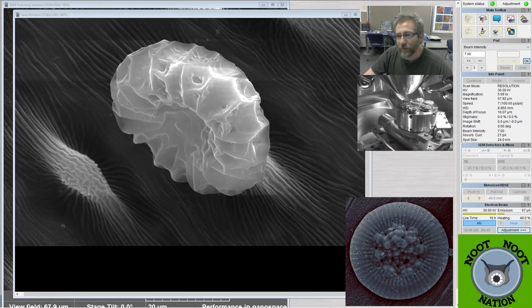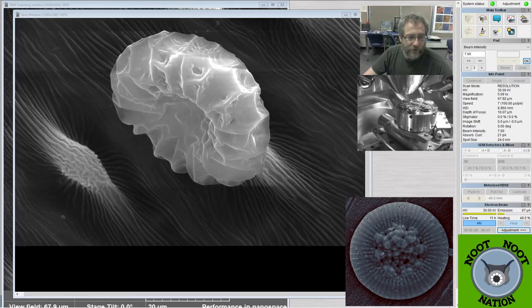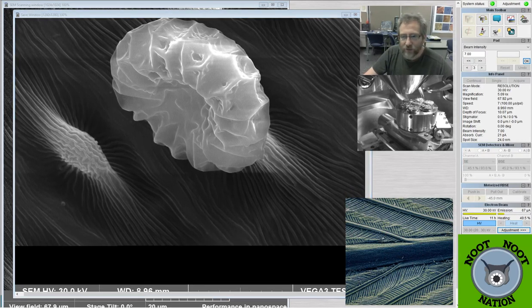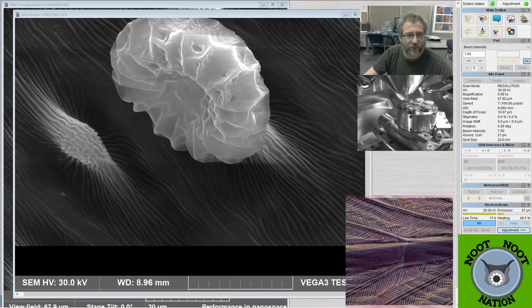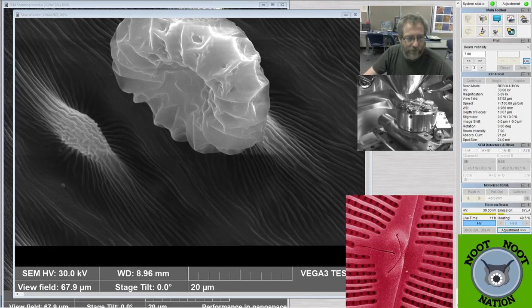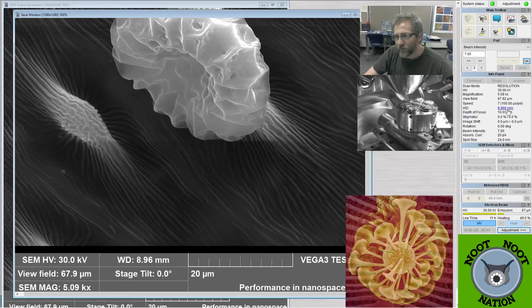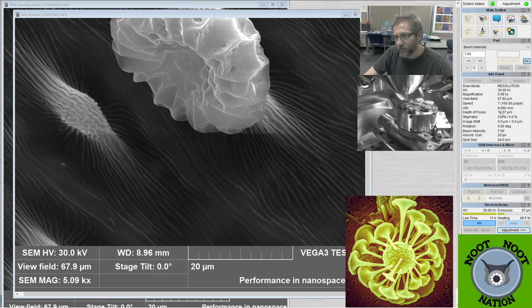It's interesting to think about focus with the SEM. It's the first time I've ever seen one in action. So the SEM actually functions a lot like a camera. Wait, can you see that part over there? Let me check. I need to see what you can see. Sorry, hang on. Yeah, you can see this box over here. So it tells you the magnification at any time, but it also tells you, if you scroll down, that's the view field. That's the depth of focus right there.